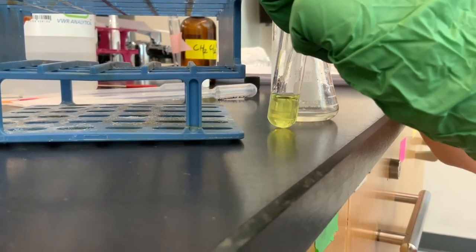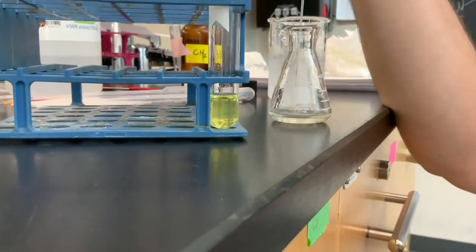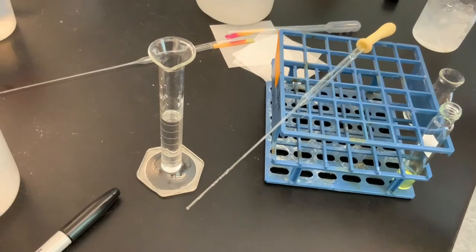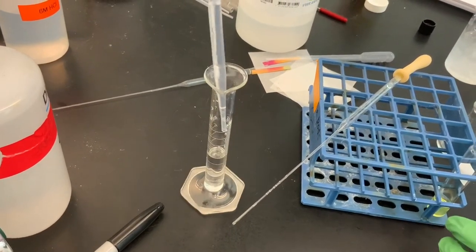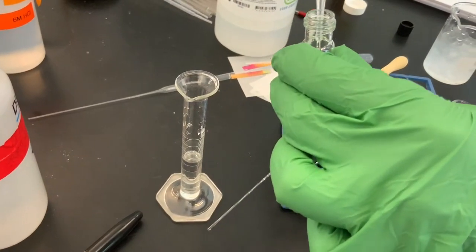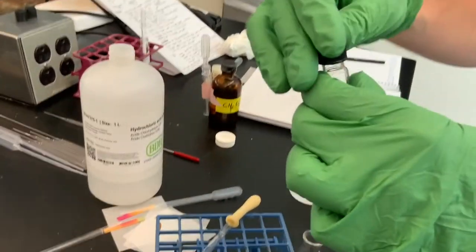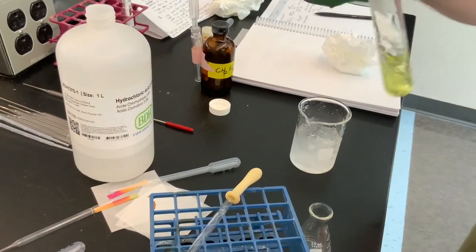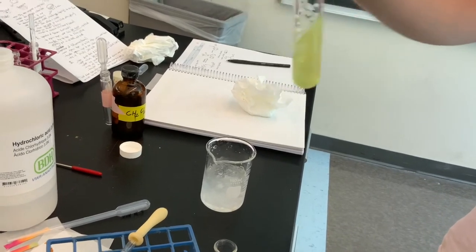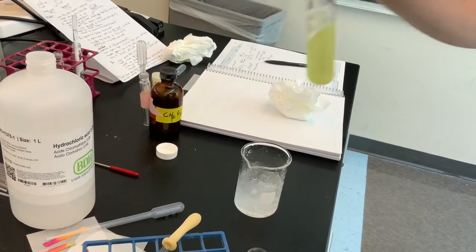Alright, so now this is our first extraction, and once again we're going to repeat this. So I'm going to add another 2 milliliters of 3 molar sodium hydroxide to my culture tube to repeat the extraction. Again, this is to try and get as much sodium benzoate over as possible. Because we started with what, 52 milligrams? Hopefully we'll get back a similar amount or something close to it if we were good with our extraction methods, or our technique, I should say.